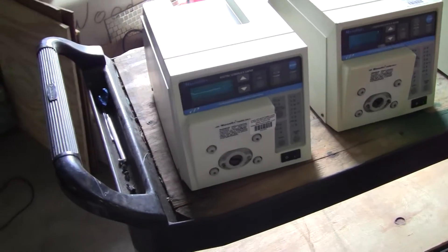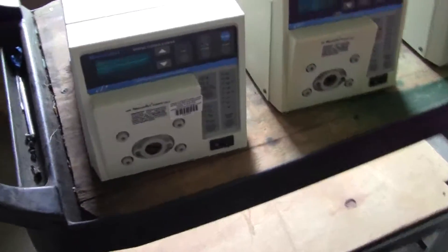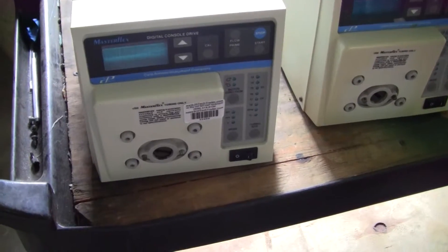Hi, this is Michael Nytao from HitechTrader. Today we're looking at some Cole Palmer MasterFlex digital control drives.